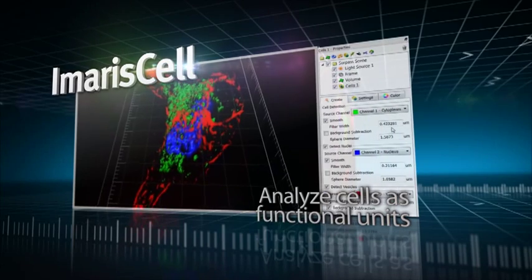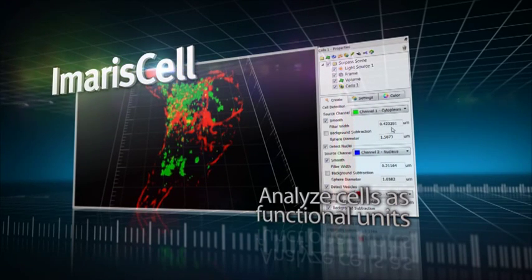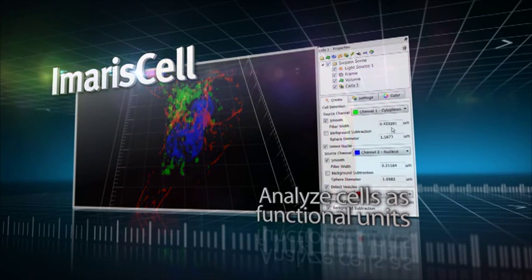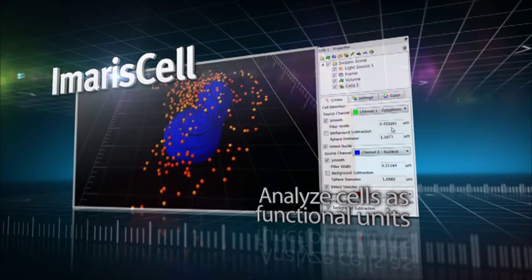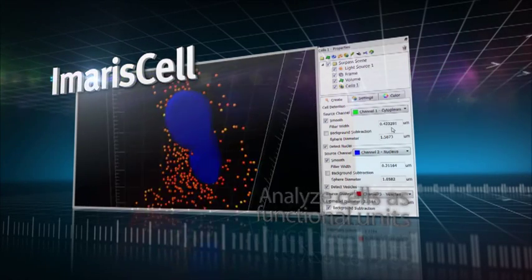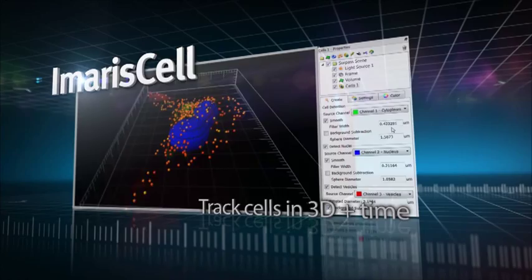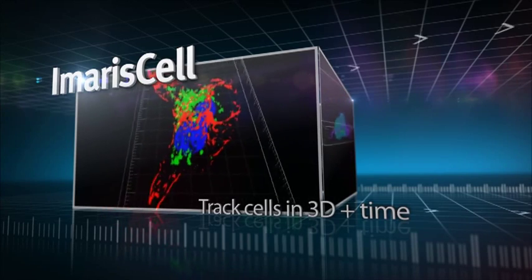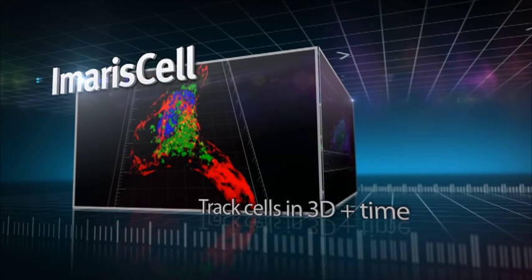Obtain novel qualitative and quantitative insights into cell structure and function. Imaris Cell makes it possible by applying biologists' concept of cells to visualize intricate relationships between compartments, as well as relations within cell groups. With Imaris Cell, you can easily segment and analyze your 3 and 4 dimensional cell images.